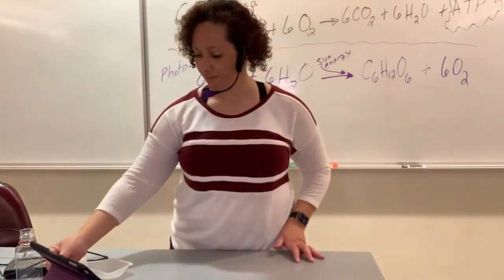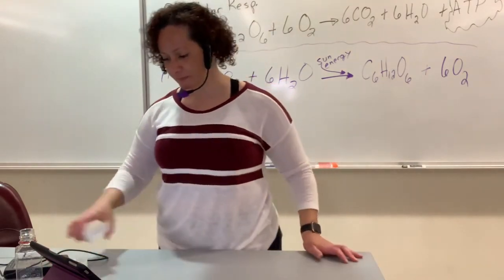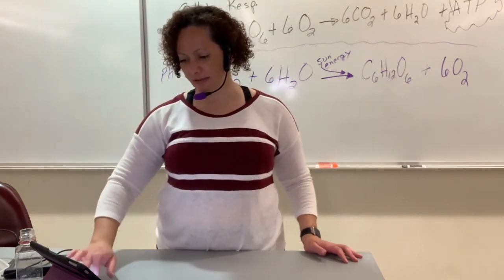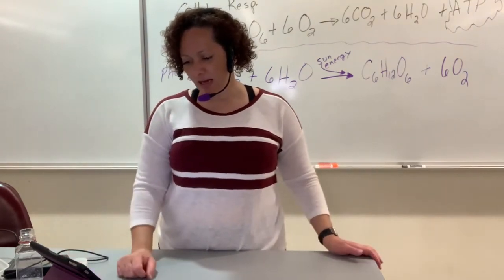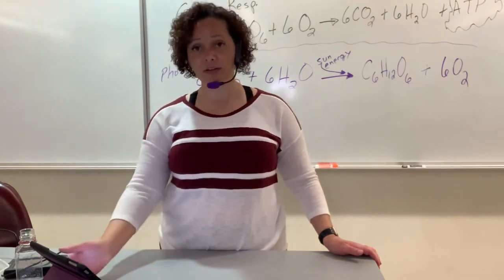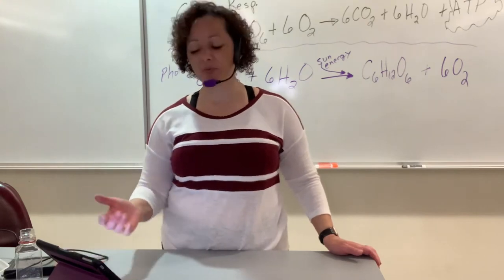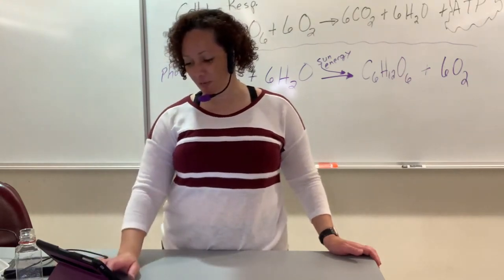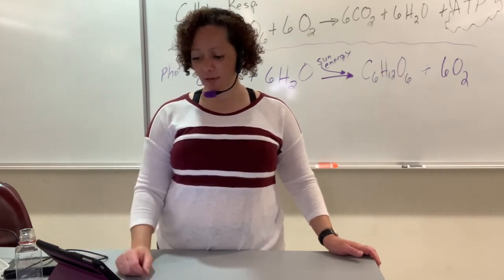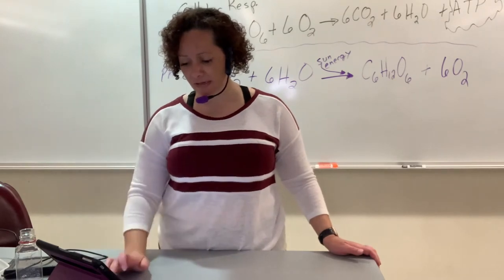Next. So once you have the mass of your organisms, you're going to go ahead and put the mass of those organisms in your table 1 results. So I'm looking at your lab report. Alrighty, so with that, if you just did the mass of the organisms but you didn't do the actual difference, that's fine. Just leave that part blank.